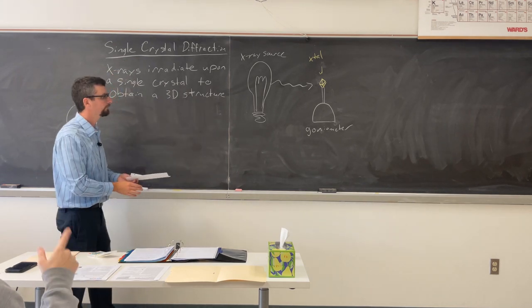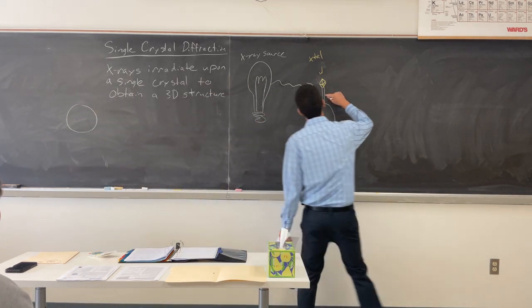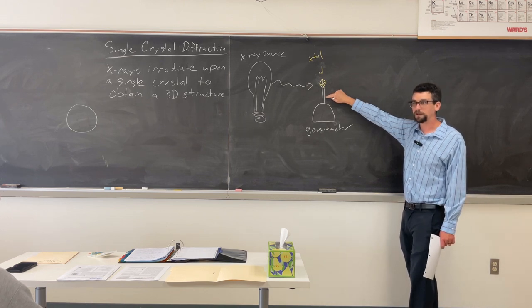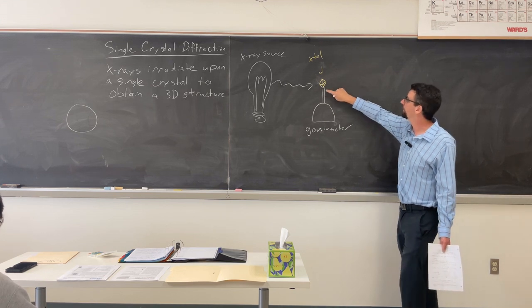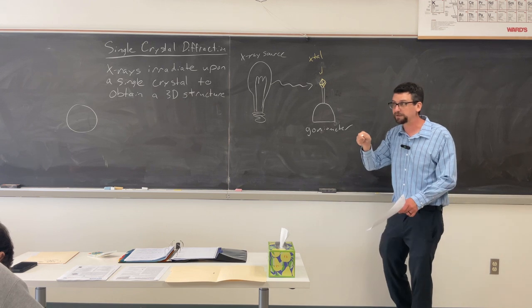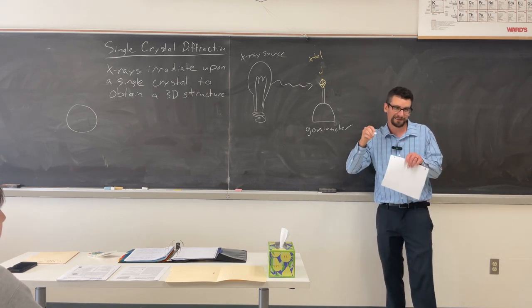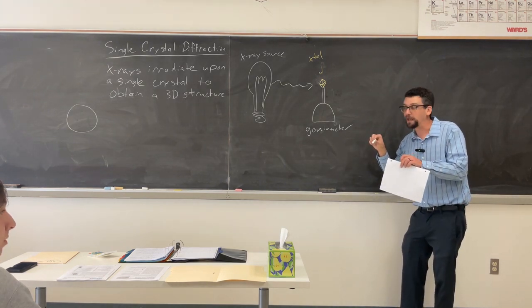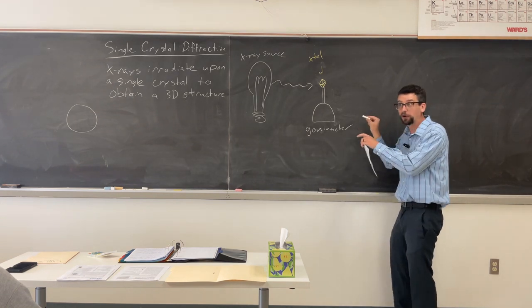This thing here is a little spike called a crystal mounting spike. What you do is you have a little bit of oil and you pick up a single crystal. You're going to have to do that for experimental physics downstairs, I believe. Have you tried it yet or no? I don't know if you'll have to do it under a microscope, but you do it under a microscope.